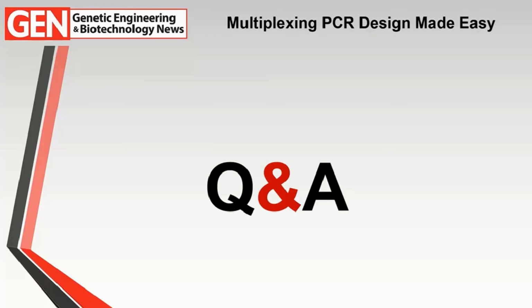Sometimes people who are experimental would rather change a base here and there to optimize their multiplex, and there are some guidelines that they have, and it can become really hairy if you do those things and you're not doing it systematically, because the multiplex can get out of hand. You cannot just tweak it manually, if you will. So that's what I meant. That was right for us.